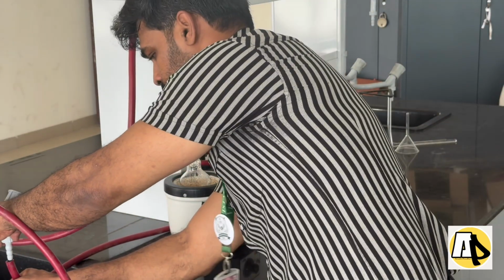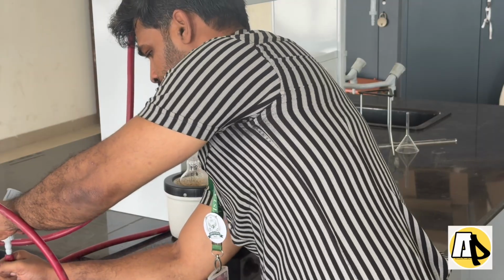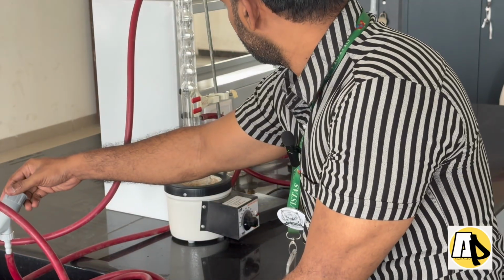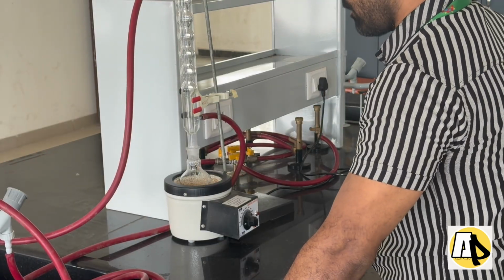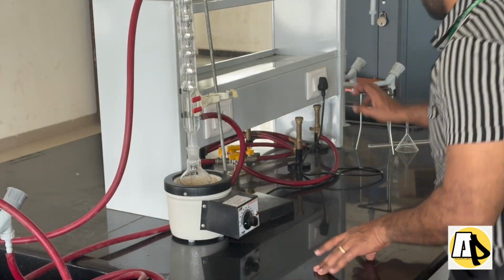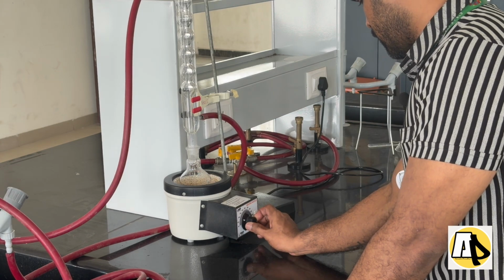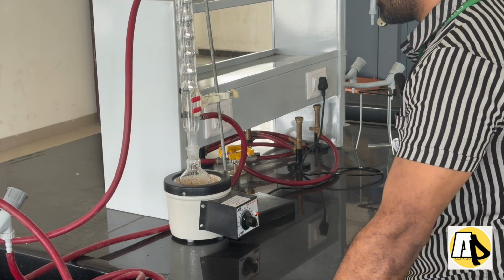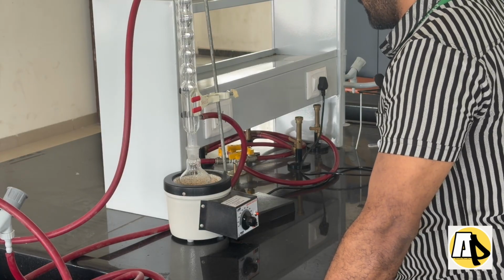I am giving the connection to the water inlet. You can see the condenser level rising and the water also dropping properly. Yes, now I can switch it on. Keep it at 20% so that the boiling point remains at 60 to 70 degrees centigrade.